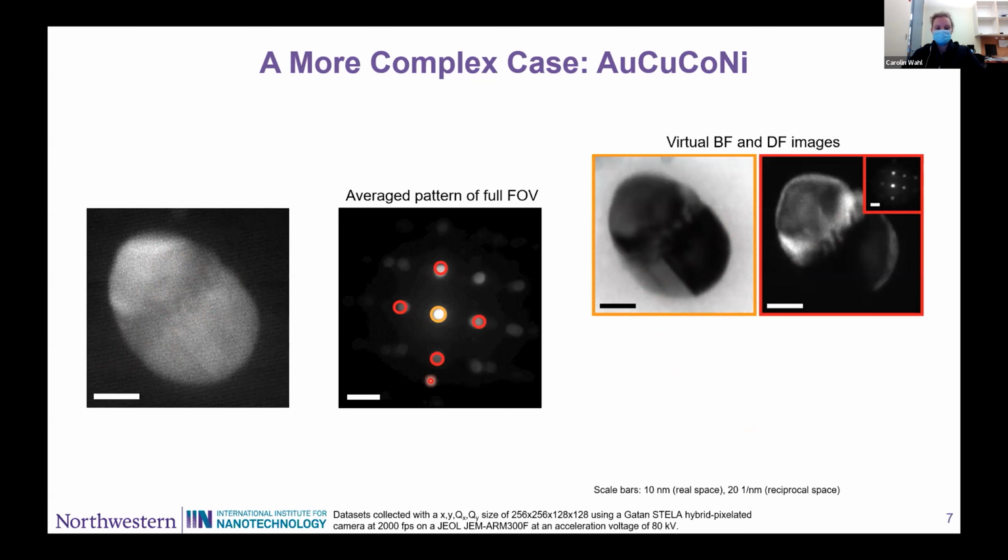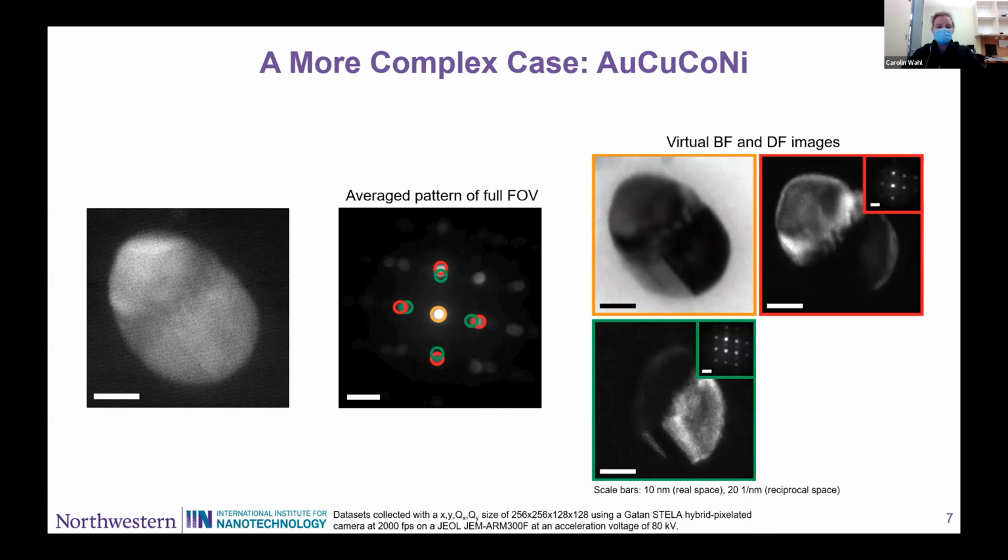So we selected those 4 spots over here. And then very close to this, you can see those spots are kind of elongated. So very close to this, we actually have a different set of spots here, which again have a similar orientation but a different lattice parameter. So this is where our other phases are, and you can see all the spots that are in between the bright ones. So this is likely the intermetallic phase because it has more spots.